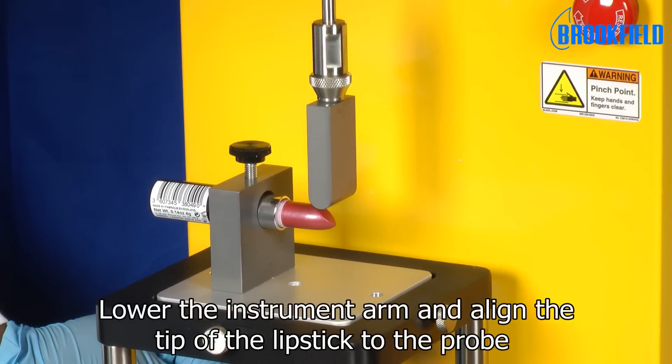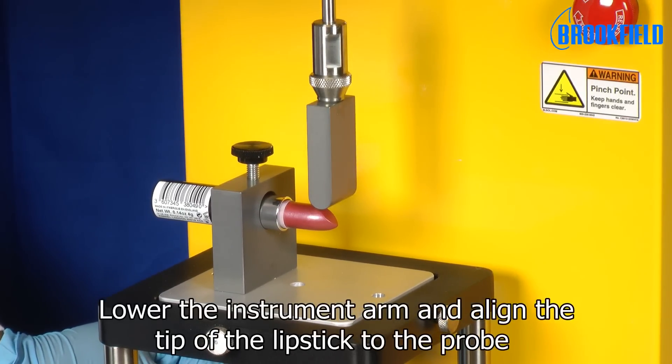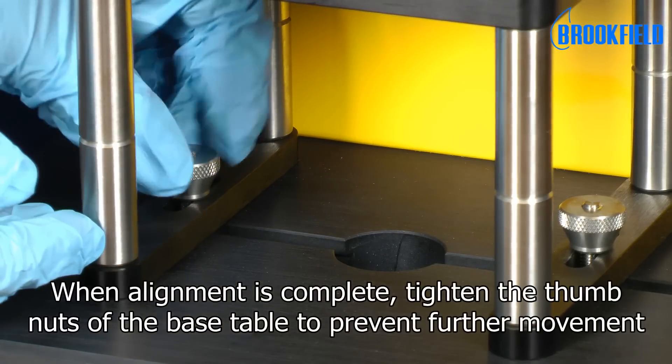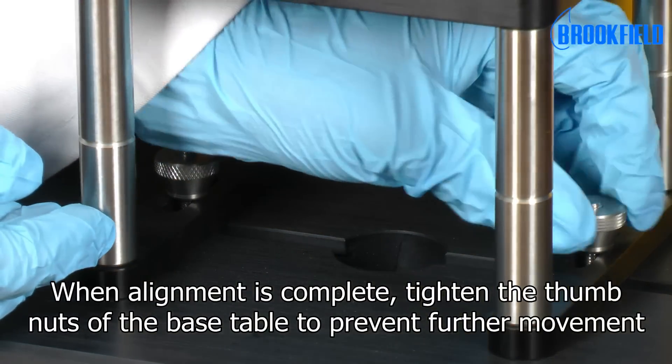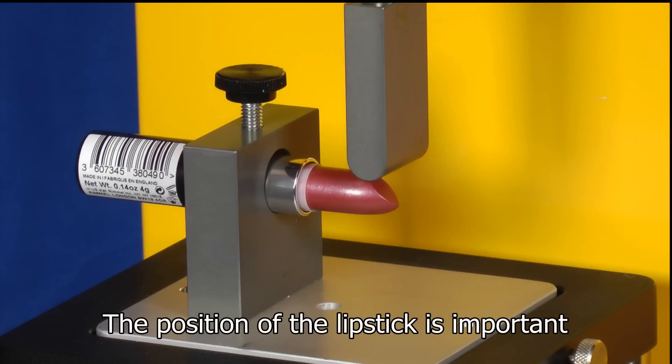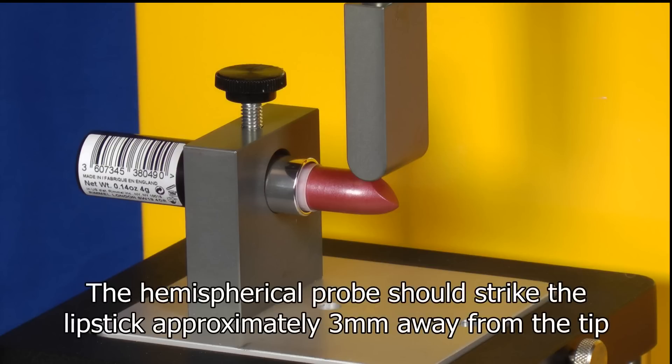Lower the instrument arm and align the tip of the lipstick to the probe. When alignment is complete, tighten the thumb nuts of the base table to prevent further movement. The position of the lipstick is important — the hemispherical probe should strike the lipstick approximately 3mm away from the tip.